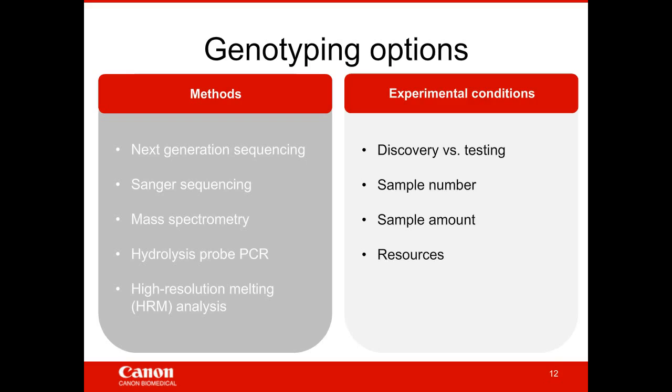Not just the amount of people or technicians you have and their skill sets available, but also budget and costs towards your genotyping effort. For example, do you want them to spend their time on genotyping methodology that requires a robust knowledge of bioinformatics analysis? Or would you rather those resources be applied elsewhere?